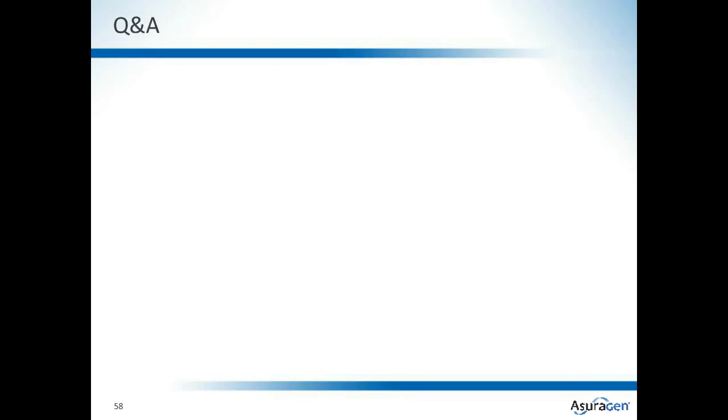So moving into the Q&A session, looks like the first question relates to RNAseq, and it is, how does your FFPE RNAseq workflow compare to the Illumina Access FFPE RNAseq assay? So to answer this, first off, I should say that we have not done a head-to-head comparison between our workflow and the Illumina Access kit.